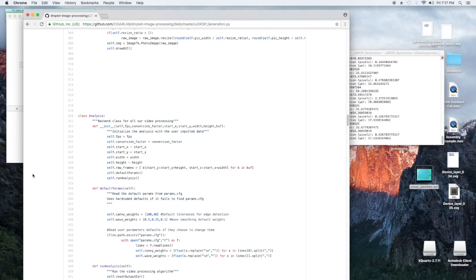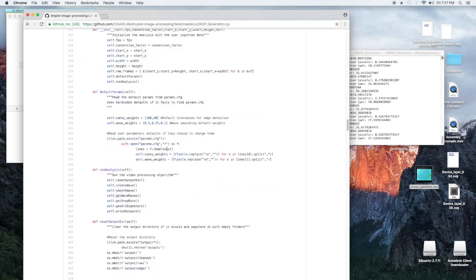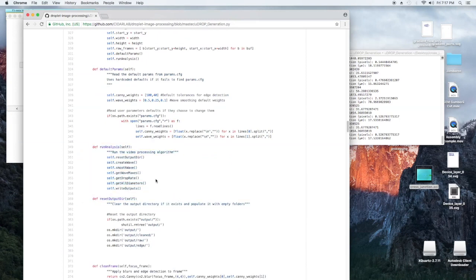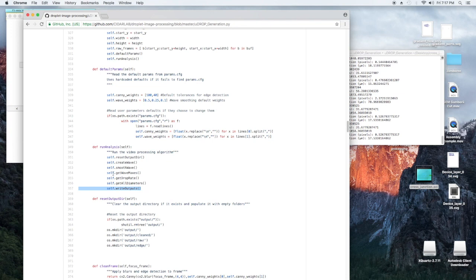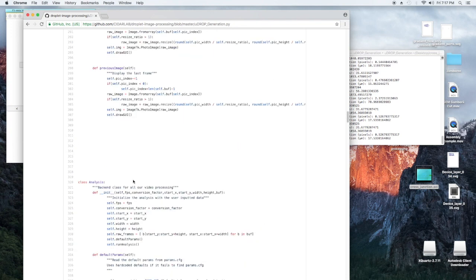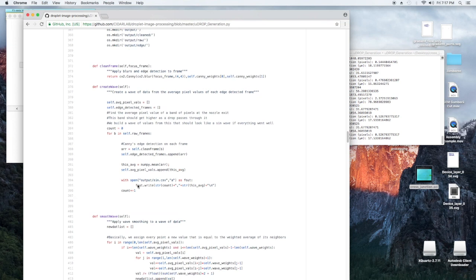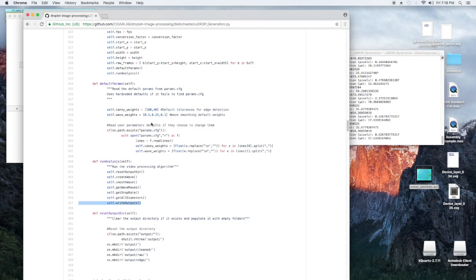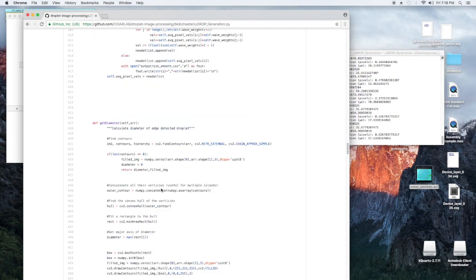So what you're probably going to want to be changing is the analysis class. So this is what actually does all the back end work. So that's doing all the calculations behind the hood. And this run analysis thing is basically the bullet points of this. So reset the output directory, create the wave from the average pixel value, smooth the wave, get the wave maxes, get the droplet generation rate from the maxes, get the diameter at each max, and then write the outputs. So very simple. Some things you're going to want to change in the future, maybe doing this by frame correlation instead of average pixel value. However you decide to change it up, the changes would go in this class analysis.